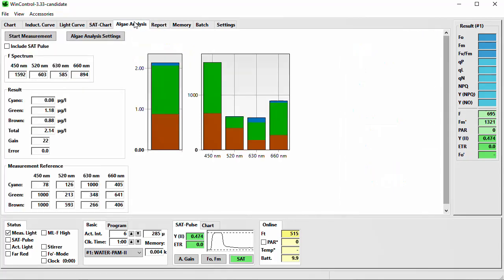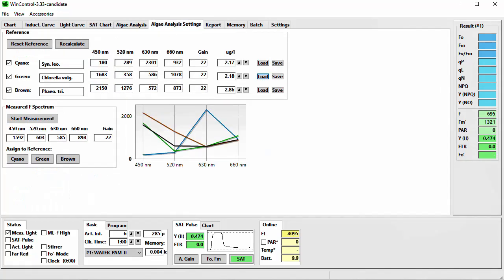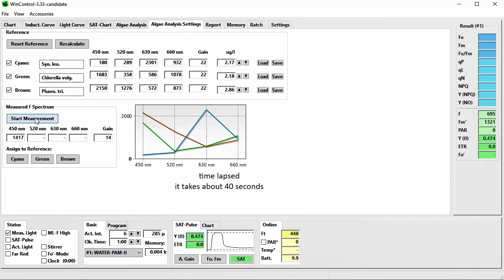Now I come back to the Algae Analysis Settings — this is a special settings tab only available when a WaterPump 2 instrument is connected. You can open it with the Algae Analysis Settings button. Here are the original datasets of the applied references listed — fluorescence values, applied gain, and the concentration according to the Sigma-Aldrich chlorophyll A standard. The spectra of the references are shown in green, blue, and brown colors according to their group name. There is also a black graph showing the fluorescence of the last algae analysis determination. On this tab you can generate your own specific references — insert a sample of the algae strain of interest and measure the F-Spectrum by pressing Start Measurement. Then you can assign this spectrum to a reference: either Cyano, Green, or the Brown algae group.